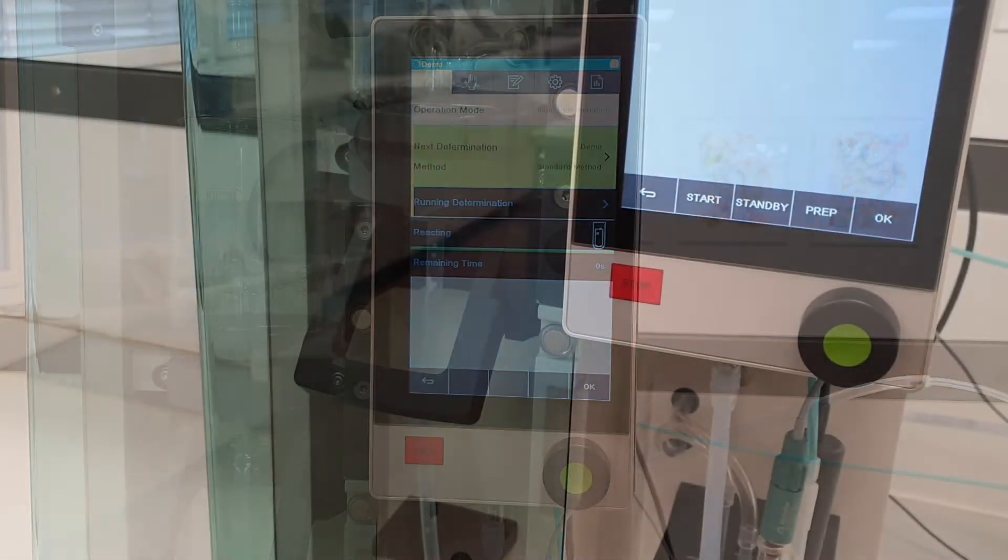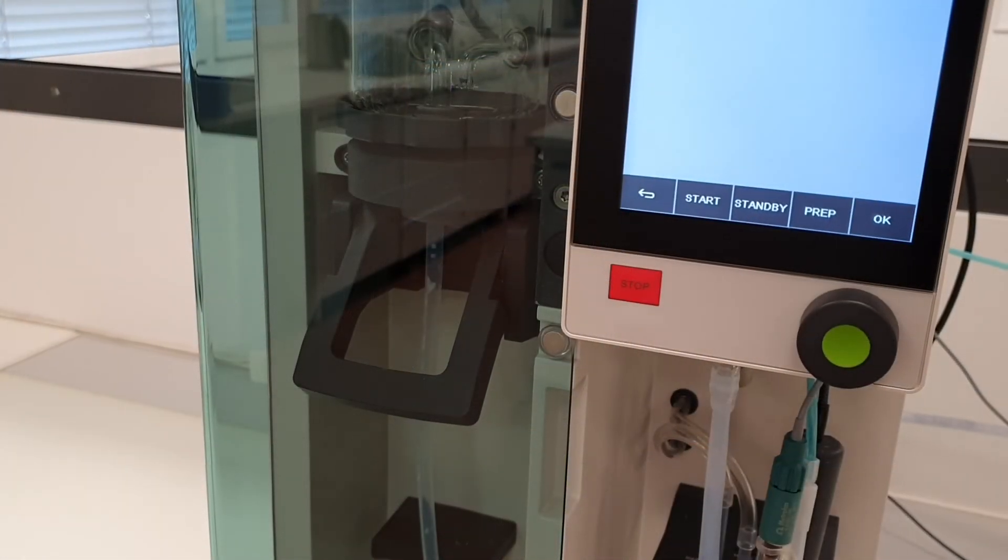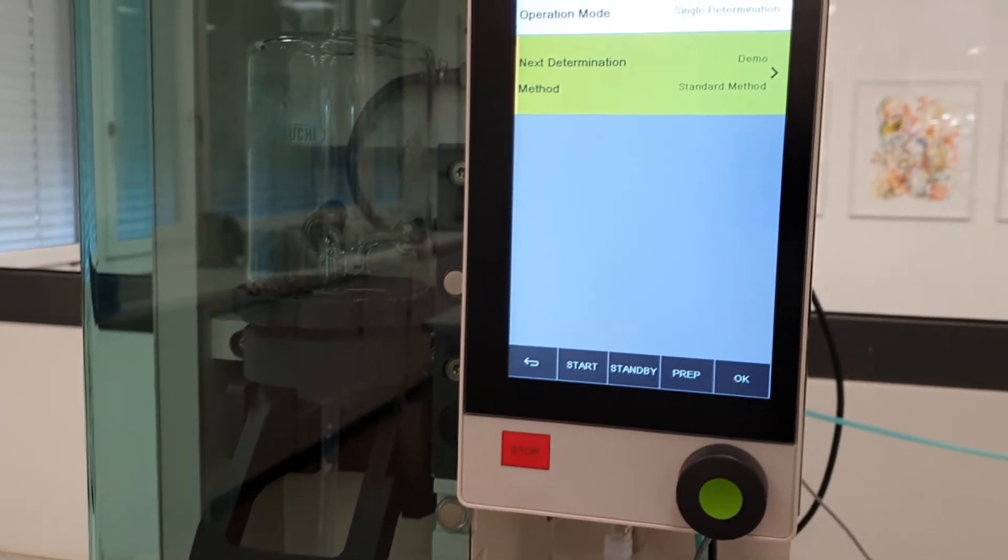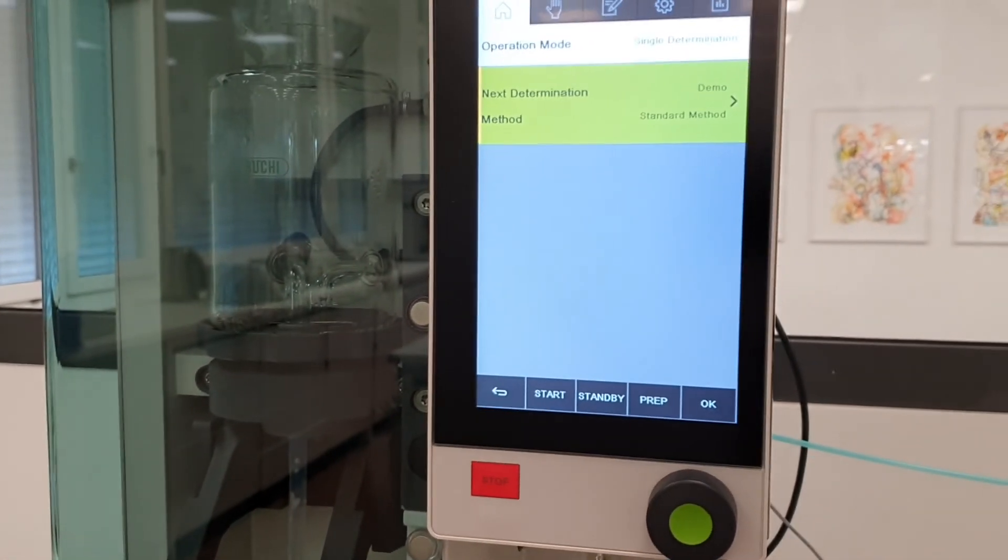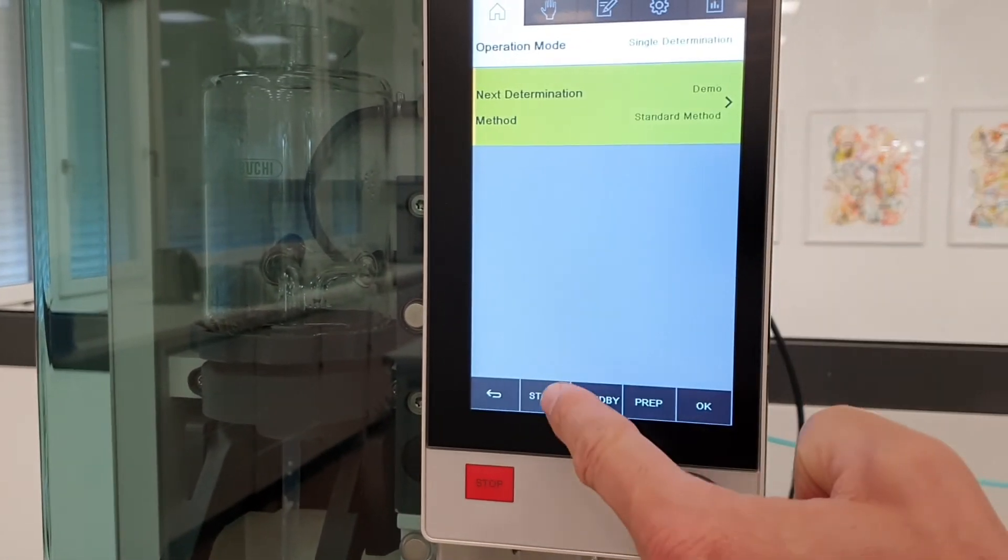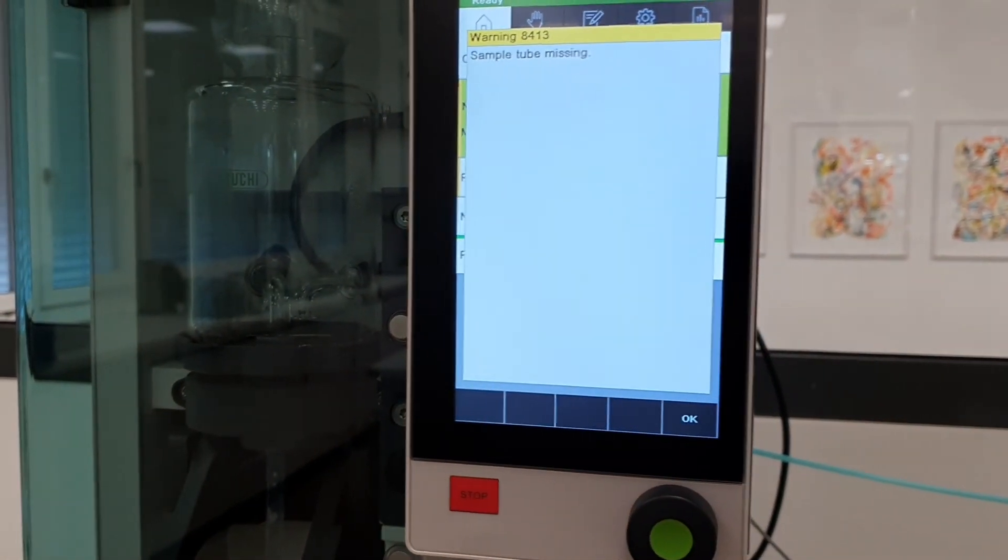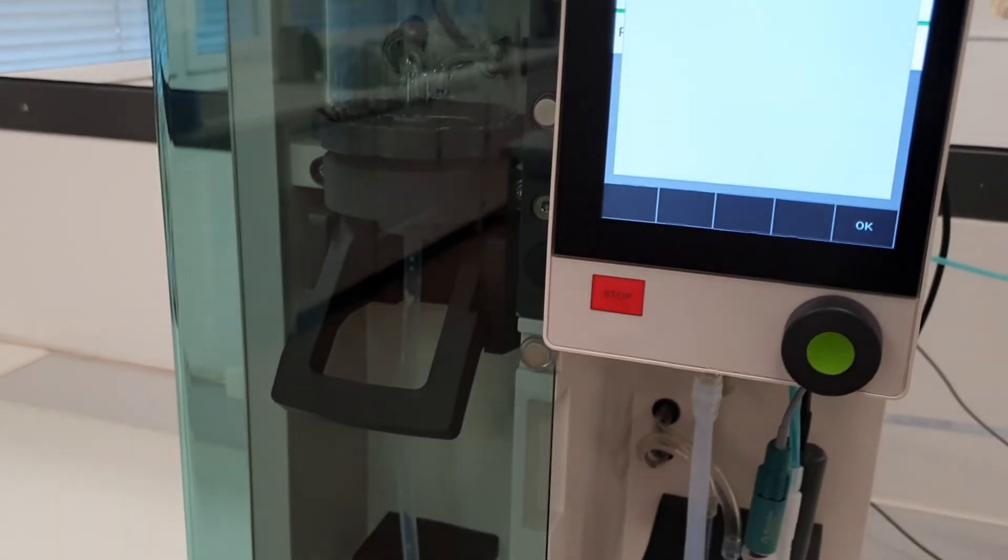Whenever a determination is started without a sample tube in place, a safety sensor detects it and the system suggests to put a sample tube in place.